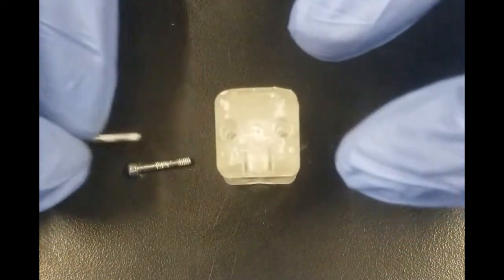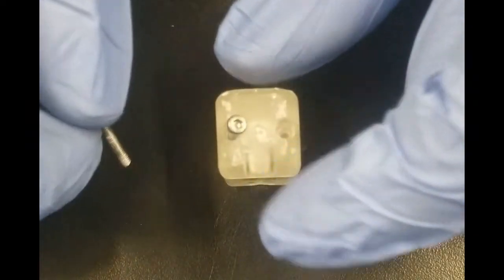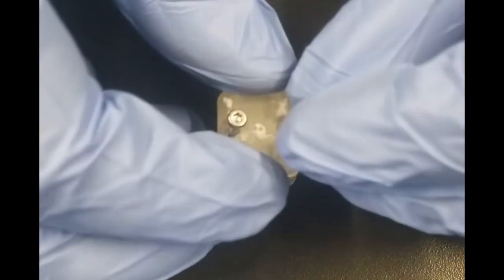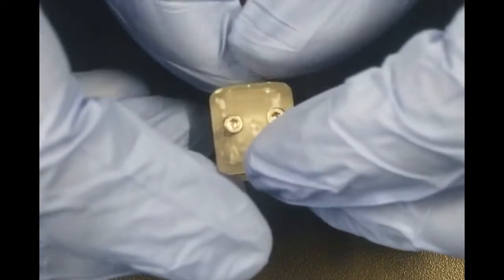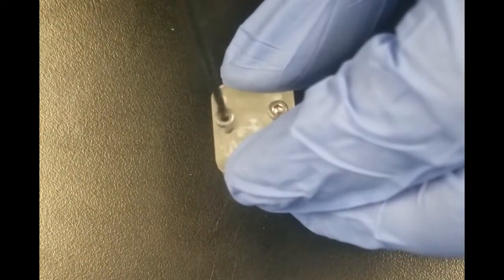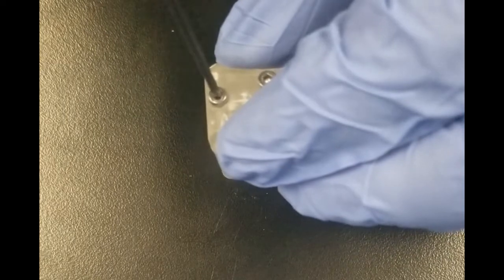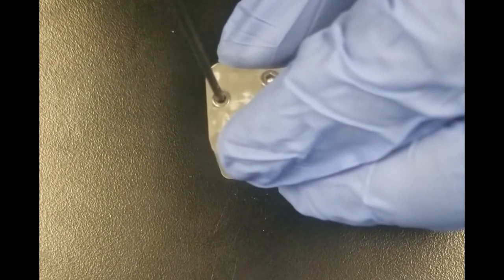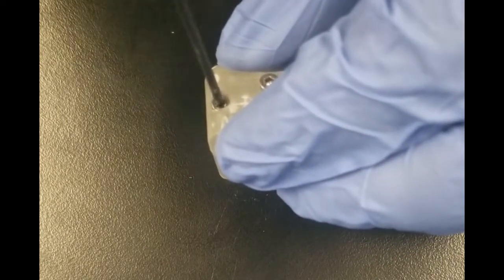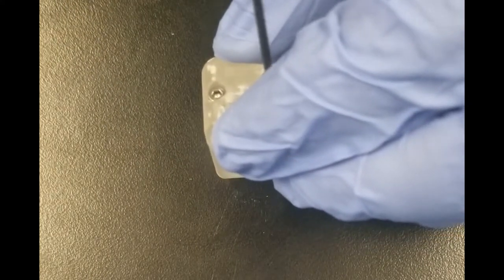I will then take the two screws and slide them into the back of the top cell and begin to tighten the screws. Once I feel a little resistance I will switch over to the other screw to balance out the forces.